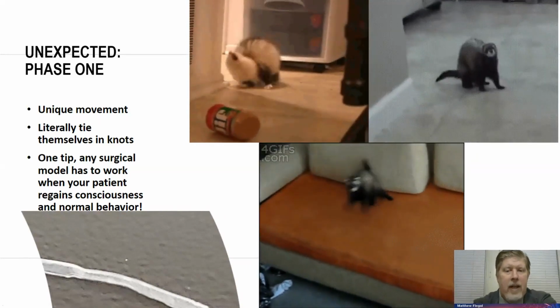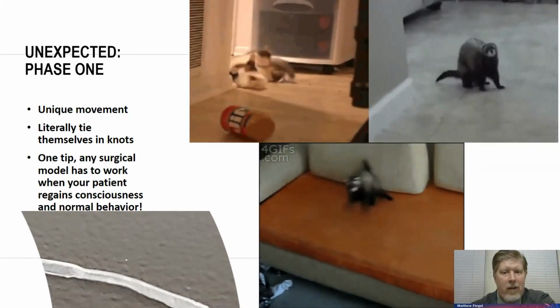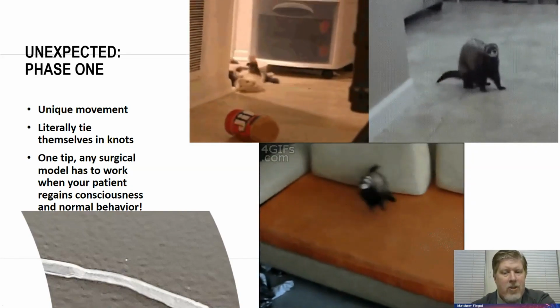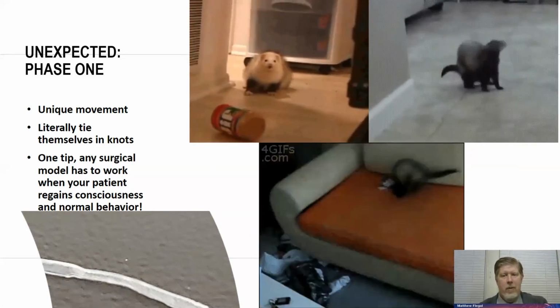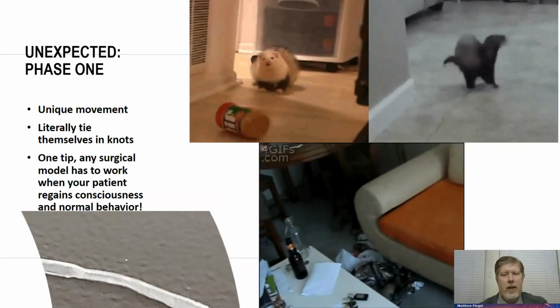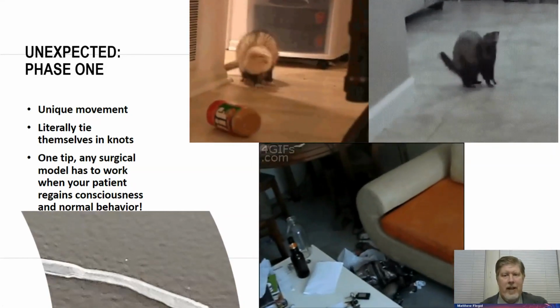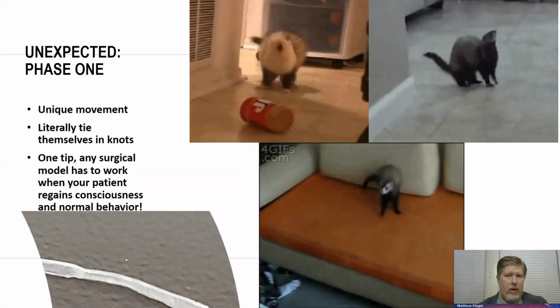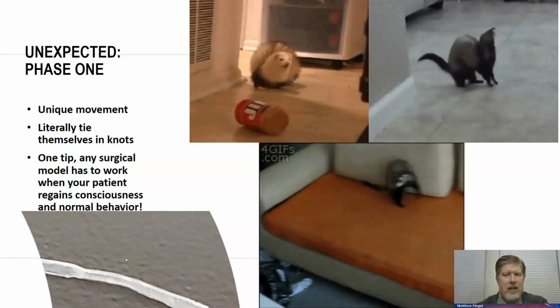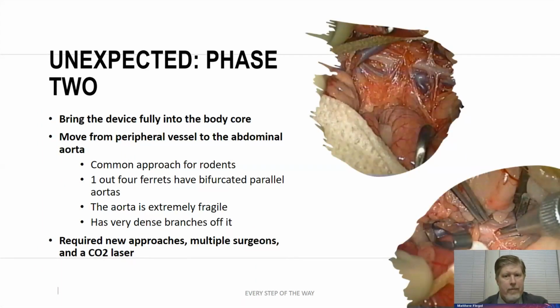And if you look down in the bottom left-hand corner, that's what happens when you put a standard polyurethane pressure cannula in an area that crosses the hip in a ferret. Just like if you take a wire and you bend it repeatedly until it starts to become brittle, it's exactly what happened here. It actually caused a change to the crystalline structure of the plastic. So that wasn't going to work. So the standard move to a femoral artery, have your transmitter placed subcutaneously, didn't work. Fair enough.